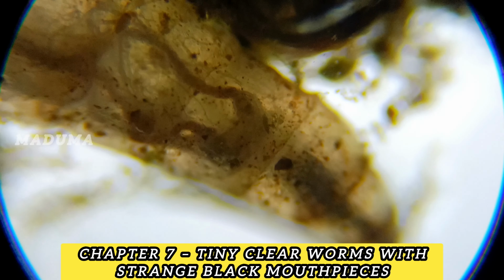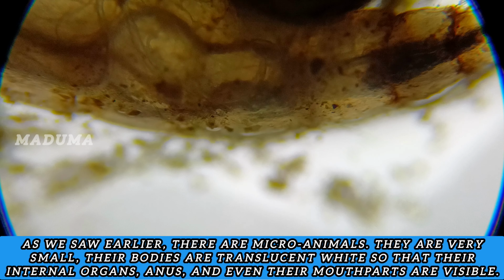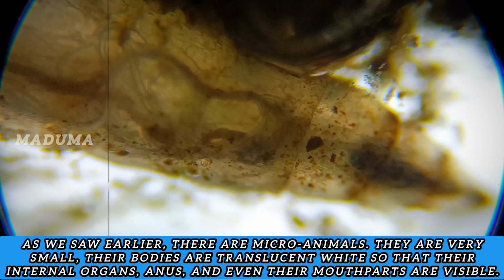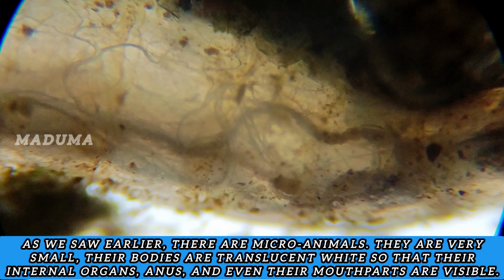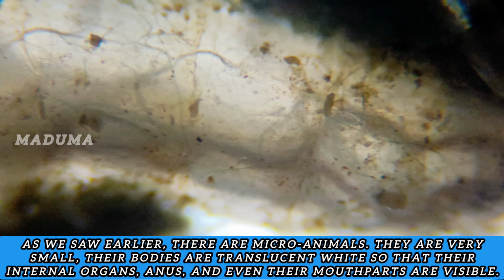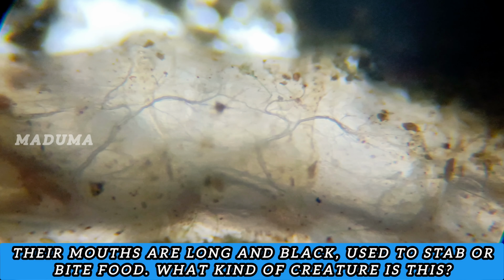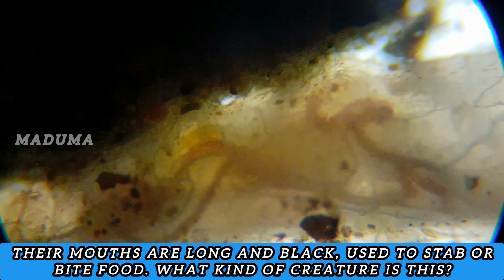Chapter 7. Tiny clear worms with strange black mouthpieces. As we saw earlier, there are microanimals. They are very small. Their bodies are translucent white, so that their internal organs, anus, and even their mouth parts are visible. Their mouths are long and black, used to stab or bite food. What kind of creature is this?